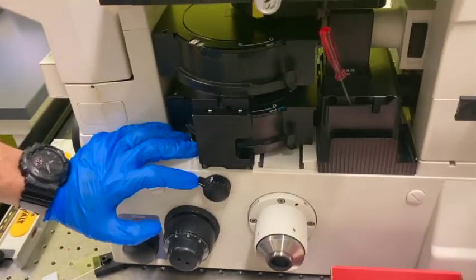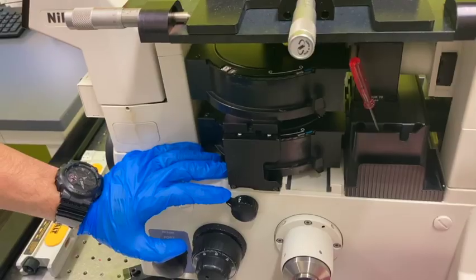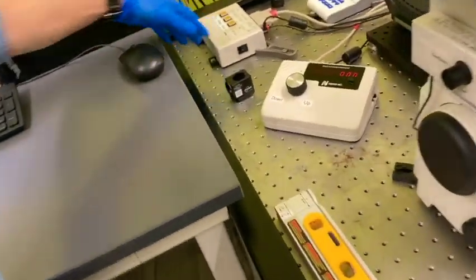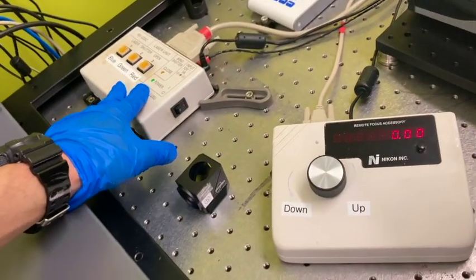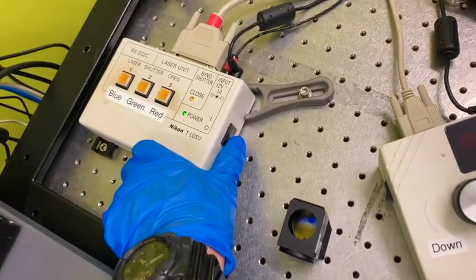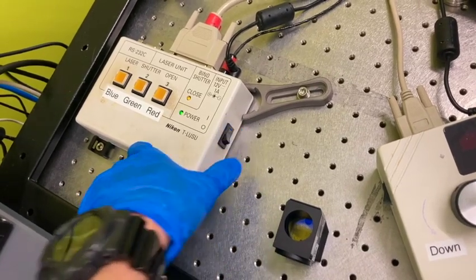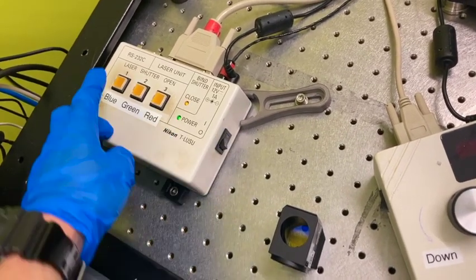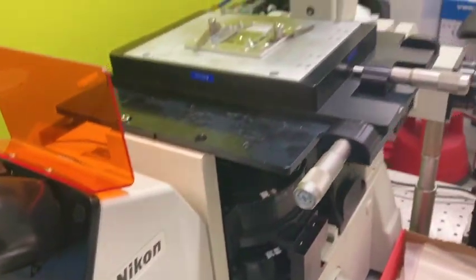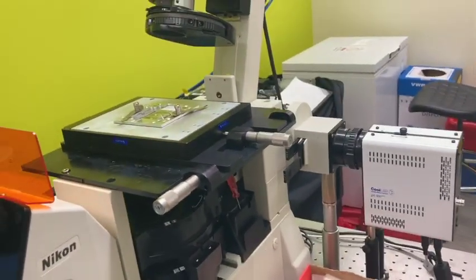And then we have power control for either of them. Here is the shutter for the laser. We have blue, green, and red, and then you need to turn this power on before you want to operate it. And blue on. Let's see if the blue light is coming through.